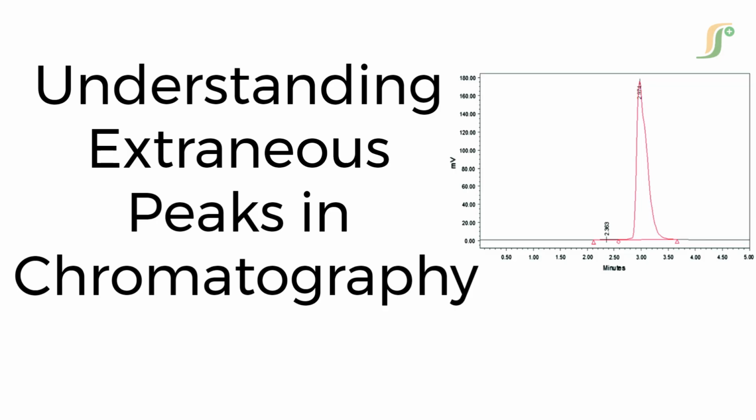Today, we are diving into a topic that often causes confusion in analytical labs: extraneous peaks in chromatography. If you have ever run an HPLC or GC method and noticed unexpected peaks on your chromatogram, you are not alone. These are called extraneous peaks, and in this video, we will explore what they are, why they appear, and how to handle them effectively.